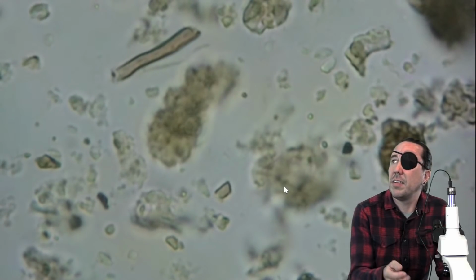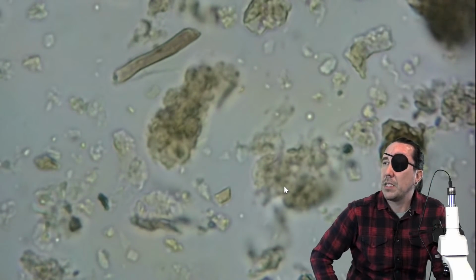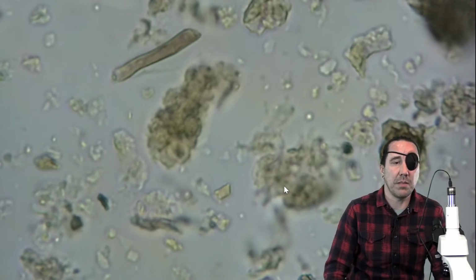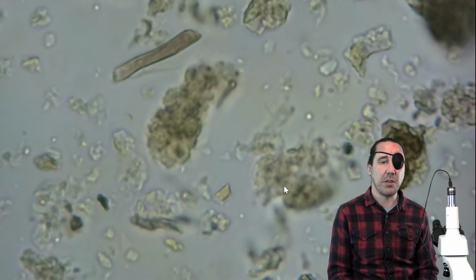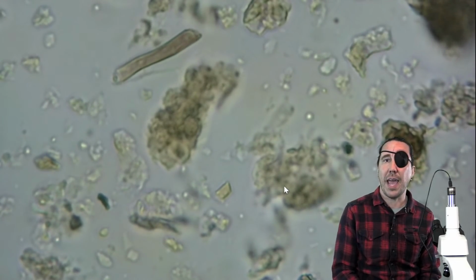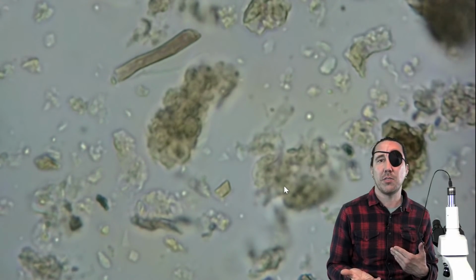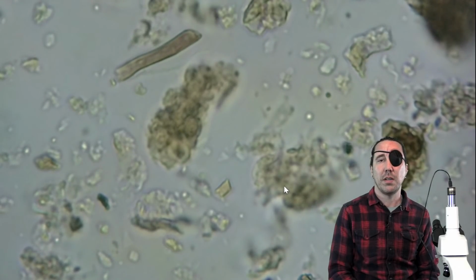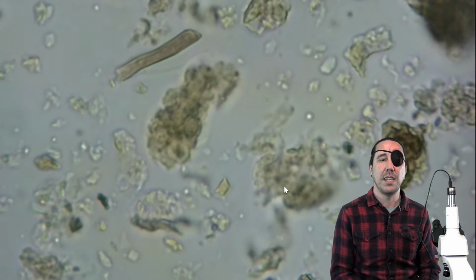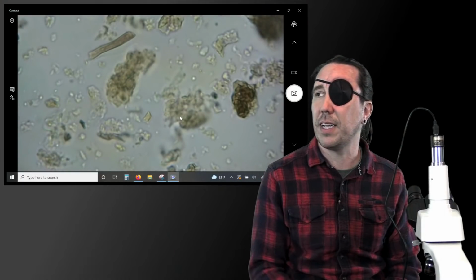Dan was just questioning, he thought maybe this compost was too dry that we're looking at the sample of. So all of these microorganisms need moisture to survive. A lot of these microorganisms like nematodes and protozoa are actually more aquatic beings. But all of them need moisture to survive. So like as humans, we dehydrate foods to save them and preserve them. The whole idea behind that is to keep bacteria and fungi from moving in and decomposing them and eating them away, before we get to eat them.